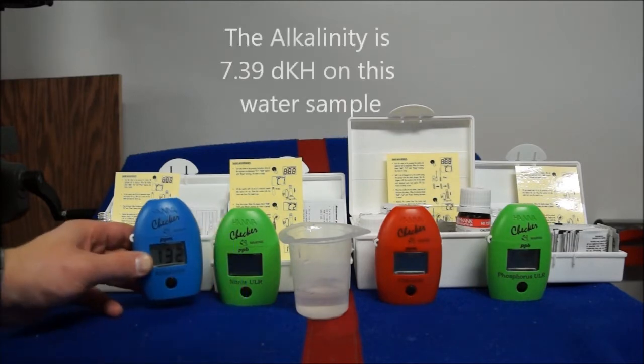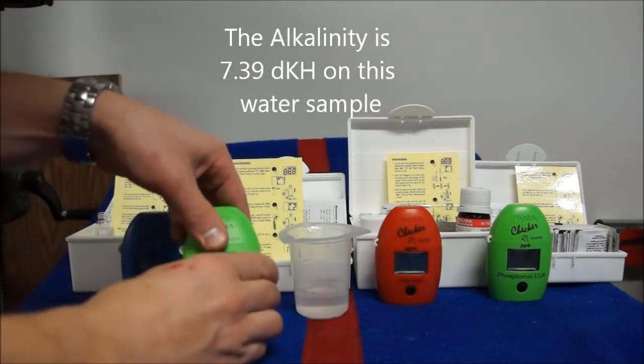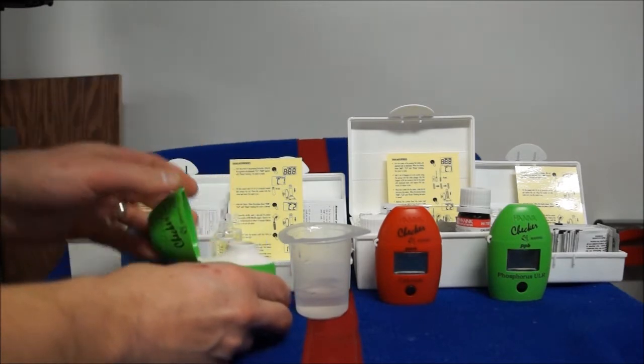That doesn't mean these are error-free — they do have errors. They can have issues depending upon how you use them. In particular, like this nitrate one which I really like — it's the marine ultra low range.